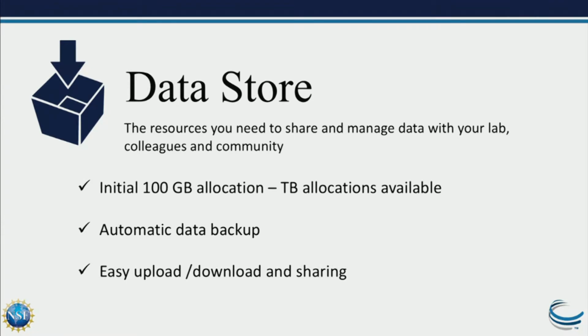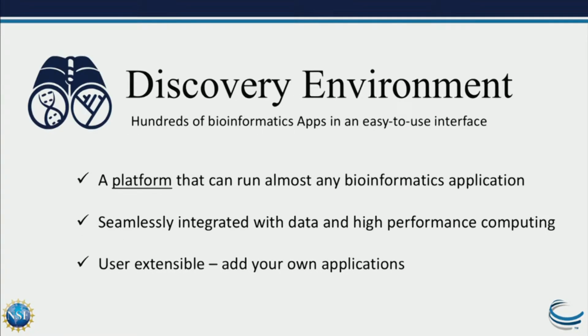Moving on from the data store, there are a couple of other things that you need to do once you have that data uploaded. The discovery environment is a web interface to hundreds of bioinformatics applications. And these are platforms. You can run almost any bioinformatics application that you'd normally run in the command line.